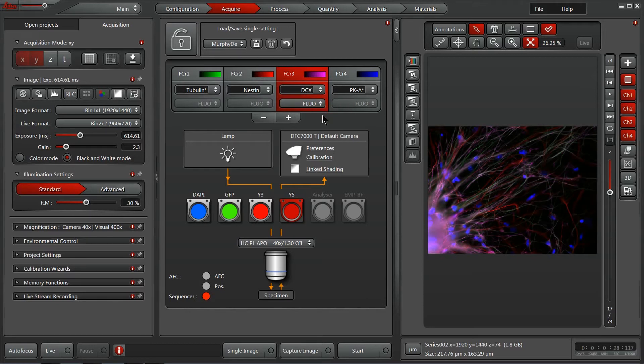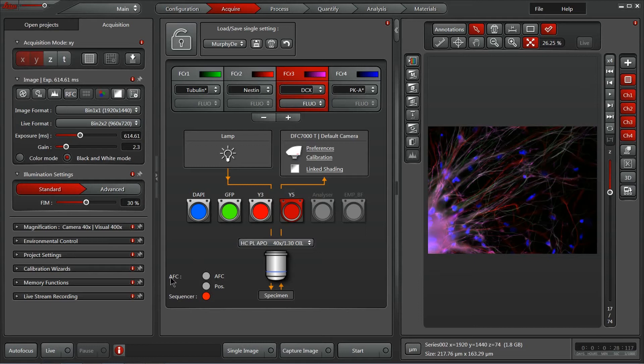For example, different transmitted light options exist here on this system because of the hardware I have. In the bottom left, we've got different indicators for our adaptive focus control or sequencer, notifying us that it's not set up or it's operating well with a green indicator.